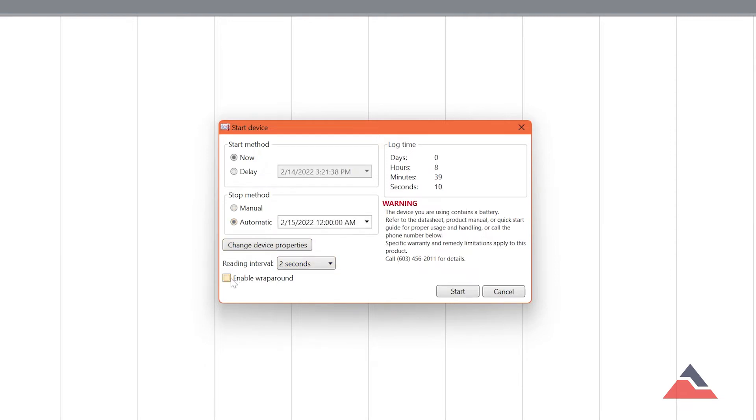If the Enable Wrap Around box is checked, the data logger will begin overwriting previous recordings when and if the internal memory capacity is reached.